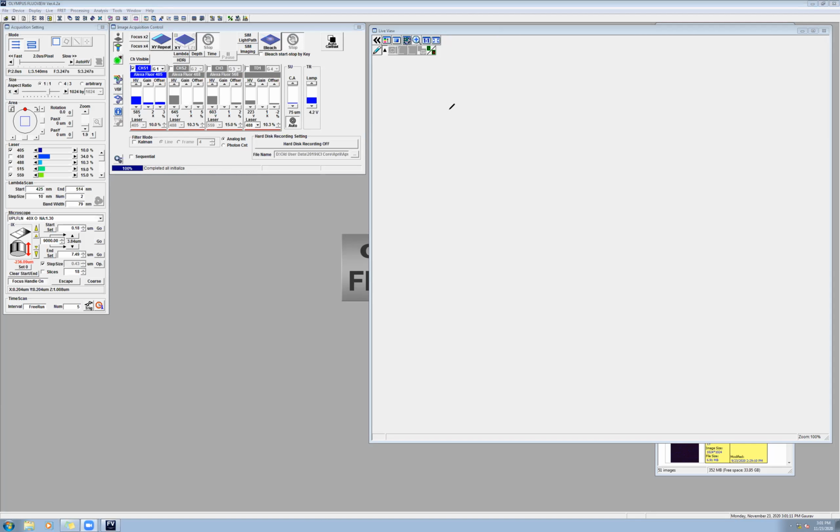So if I draw this here, and we have, let's say, 512 by 512, and you know where I'm going with this. So assume this is 512 by 512 that you are having.